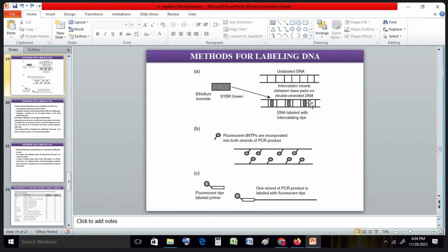So for that, as we discussed before, during multiplex PCR you have to have a difference in the size of the product. If you are doing 4 PCRs together, all the amplified products for these 4 PCR reactions should have different product sizes. So the same color will not be a problem. By having these different size products, you can interpret the results very easily.